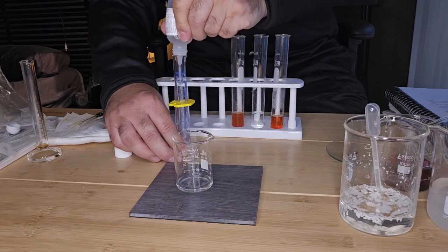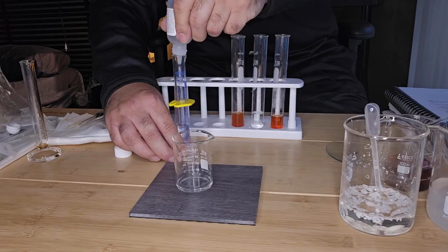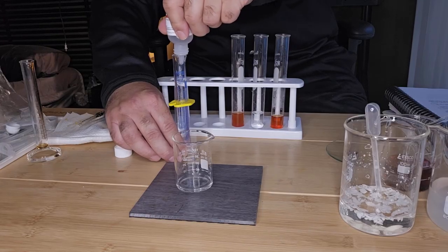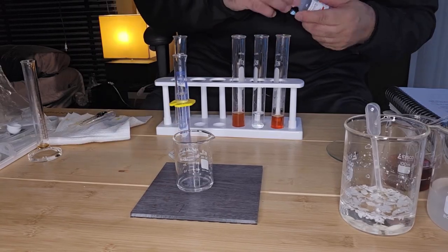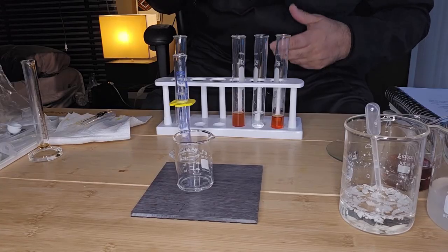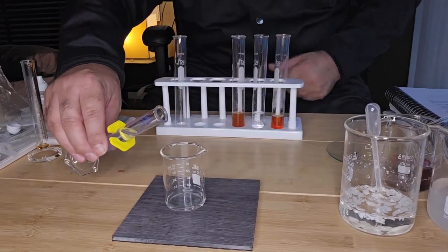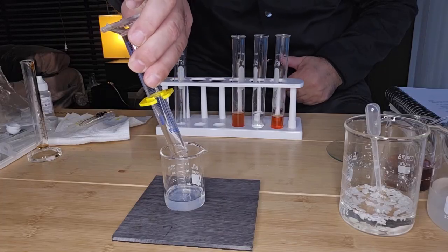It's in a dropper bottle, so it doesn't come out easily. All right, so I've got 10 mLs of ethanol, and I'm going to add that to the beaker. Okay. And I'm not going to stir it. I'm just going to pour it all in once, and then we're going to see what happens.